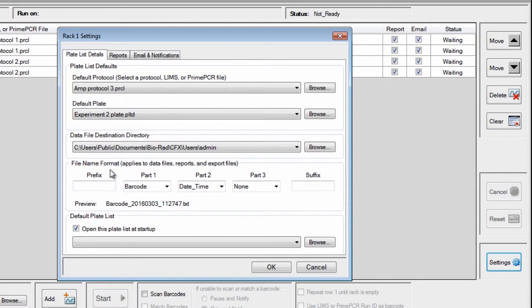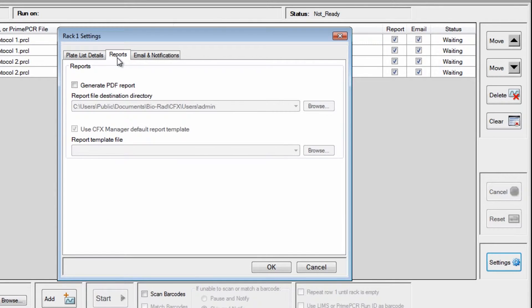If you would like to generate a run report, click on the Reports tab. Check the Generate PDF report box and pick a destination.